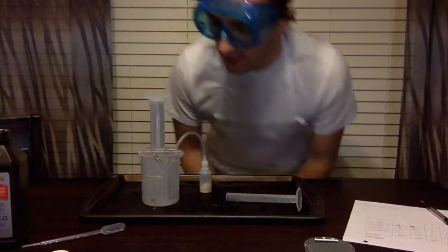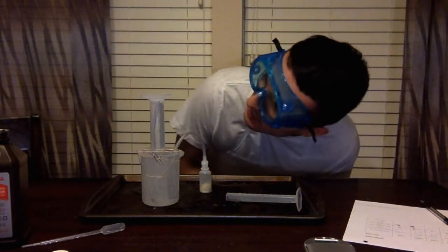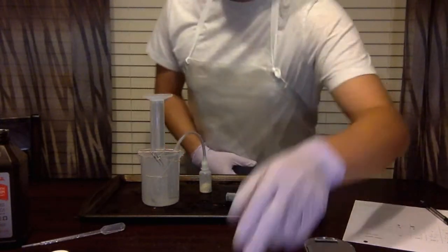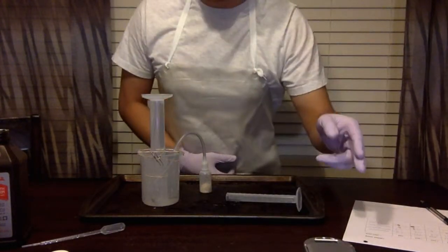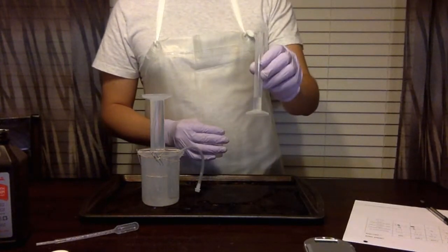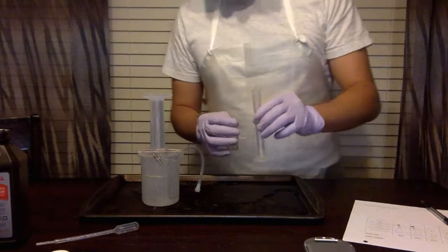All right, now that a minute is almost up, looks like we have, again, 2 milliliters of O2 produced. We will continue on to trial number 3. Commencing trial 3, this is with 2 milliliters of hydrogen peroxide.